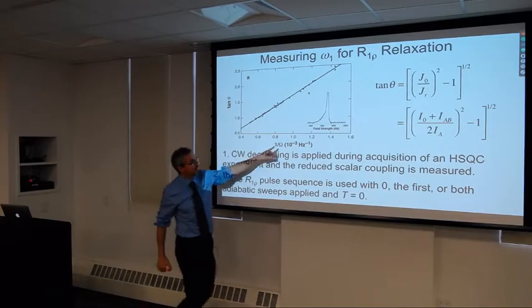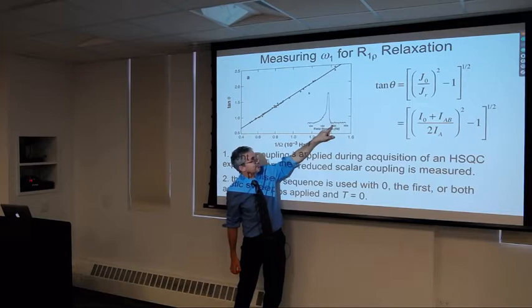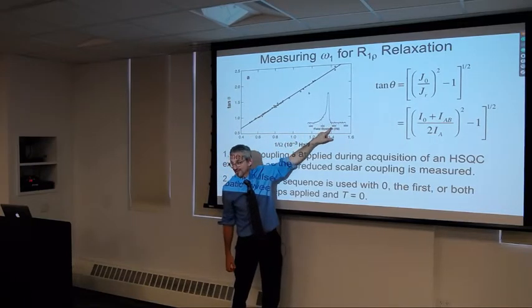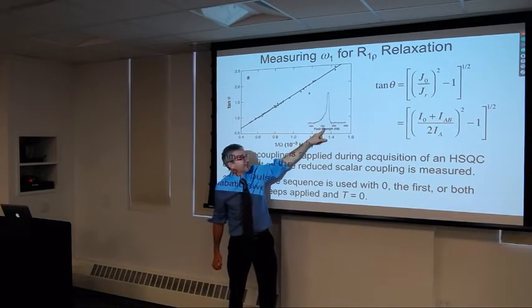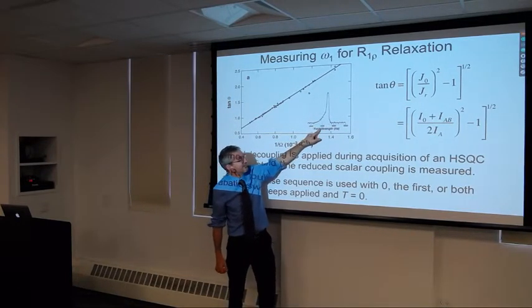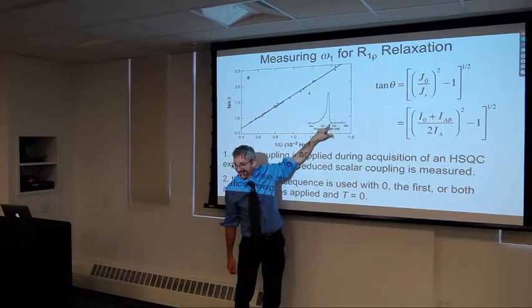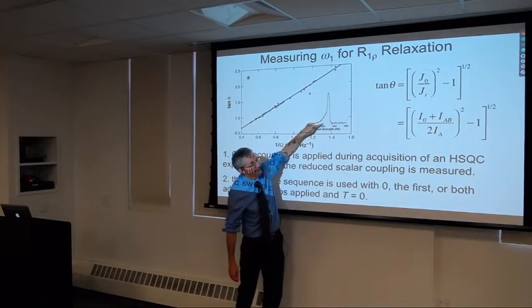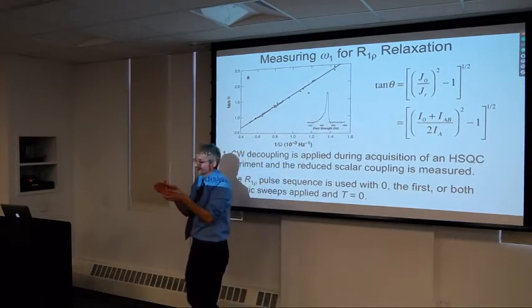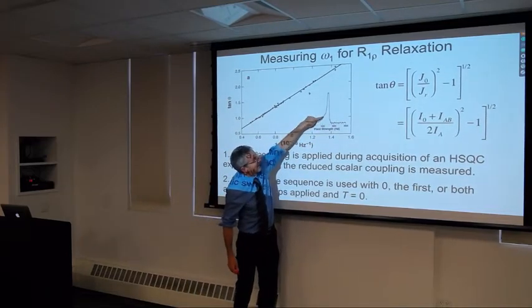And if we Fourier transform that, this then is an integrated distribution of the B1 field strength. And I hope you agree that's a pretty ugly looking profile. This is for a relatively old probe. You might imagine, in the ideal case, you would like to see a delta function, and at worst, you would like to see something that looked maybe like a Gaussian, so that there was some uncertainty. And you can see we have a Gaussian here, followed by some big lump.